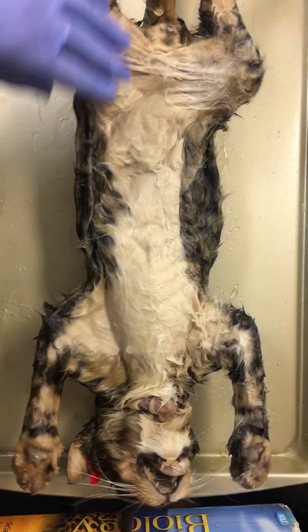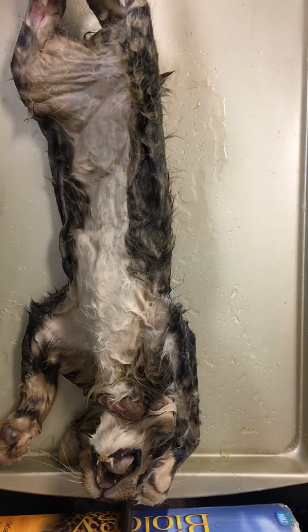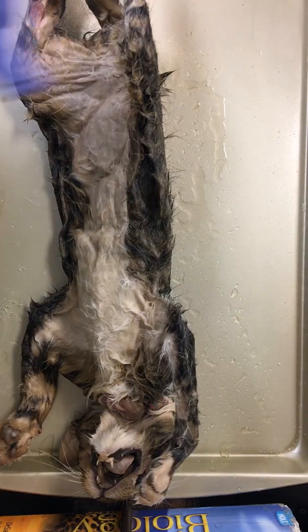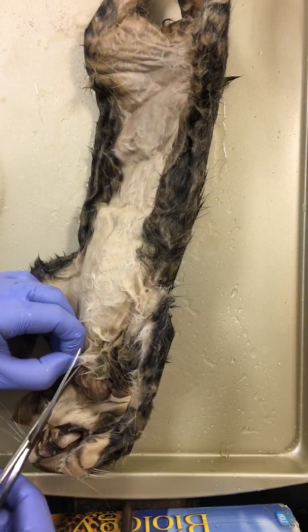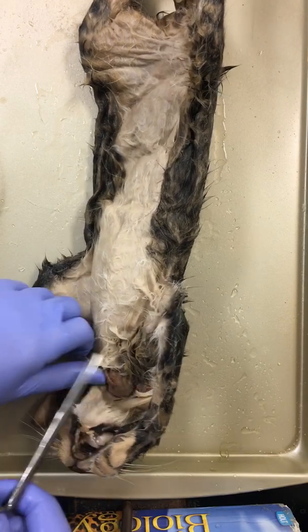For us, we would have our thumbs up. So for right now, we're going to remove the largest organ of this dissection, and that is the integumentary system.